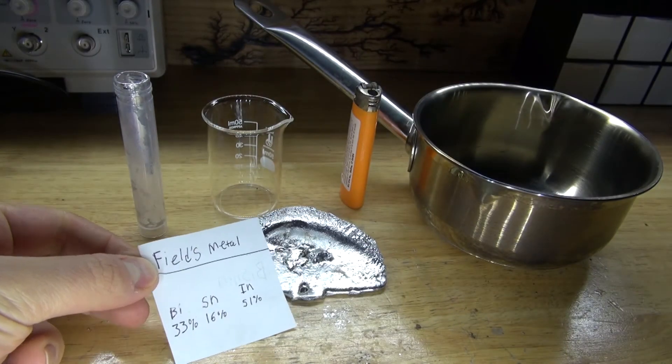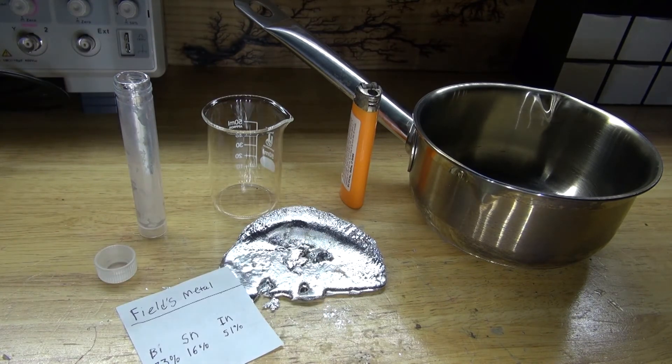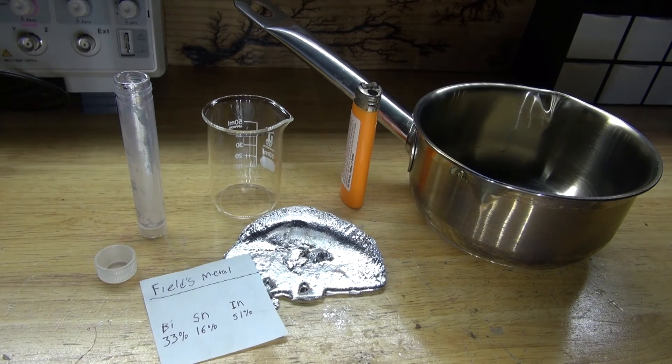And there you have it — Fields Metal, or what I like to call bisnin. This metal can be very useful for making prototyping metal parts, metal casting, or to make metal figures that pick up extremely fine detail. This metal seems to be very useful for many craft-type projects or maybe industrial-type projects. This is very interesting, and I'm probably going to use this in future videos.